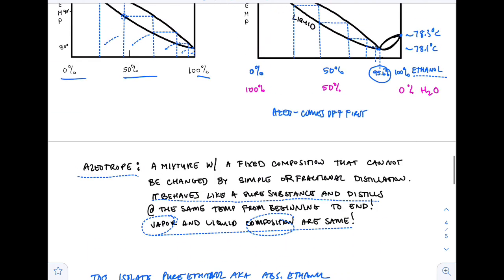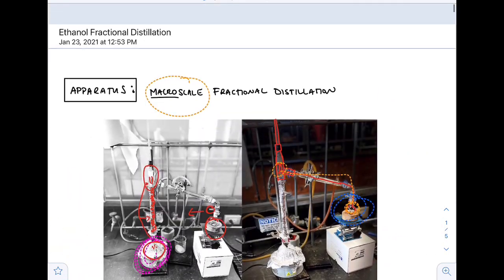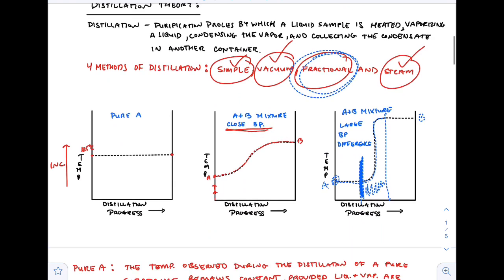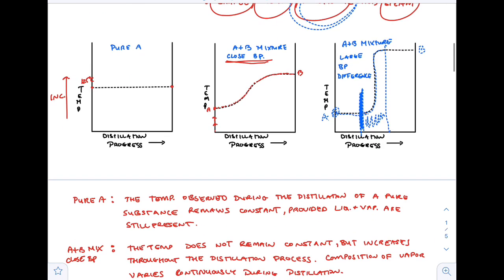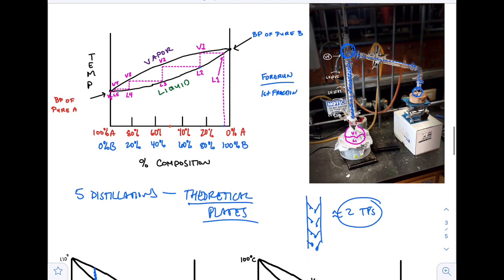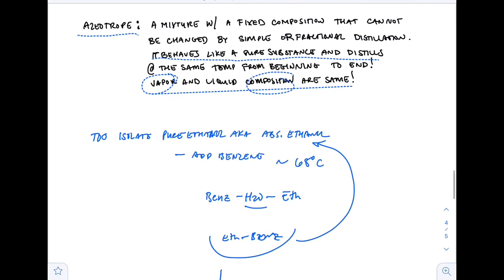So real quick, simple fractional vacuum steam distillation, right? Soup's fun. Gorgeous pictures, right? iPhone, fancy. These are the different distillation methods, the different graphs for the distillation. We needed to do fractional distillation because our boiling points were really close together, and fractional distillation is pretty dope. You still need to do it low and slow. So anytime you're doing distillations, low and slow is still the best method. It's not really my style though, so you'll see in the video. It is what it is.